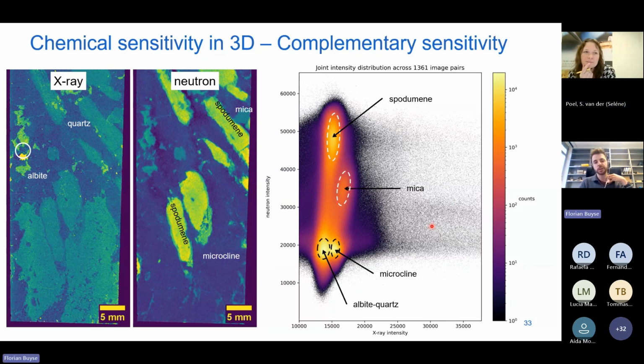Yeah, the thing there is, I tried this already. If you prepare your sample for EDS, you need to polish your sample, which is in a way not a problem if it's perfectly polished, since you can really recreate the same slice as you have with your CT data.